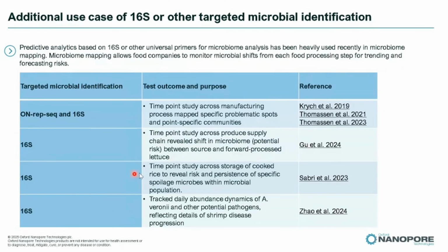Okay, so again, another time point study of processed food. So this one is for the storage of cooked rice. Okay, and then this one is checking for disease progression using 16S.